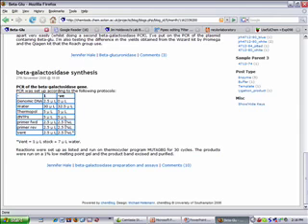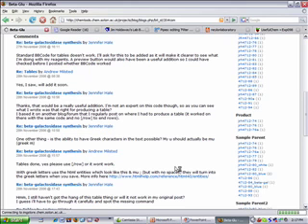So the students described an experiment down here, and in this very first experiment, you'll notice one thing at the bottom: there are 10 comments. Our first thought was, you describe what you're going to do, and then if anything changes, you make comments on it, and if anything happens, make comments on that. So a lot of this is actually about the mechanics of the system as you go down.